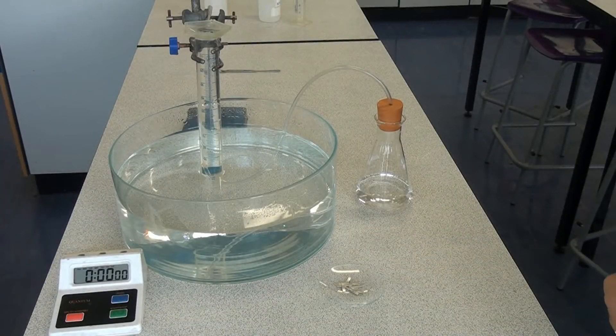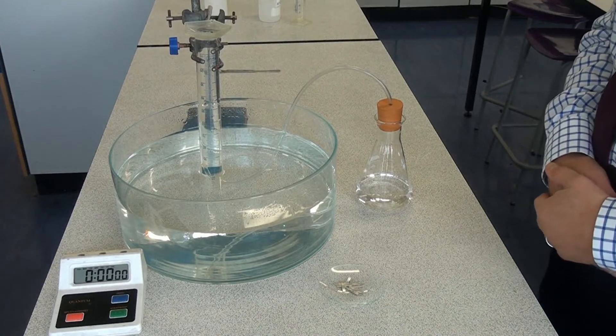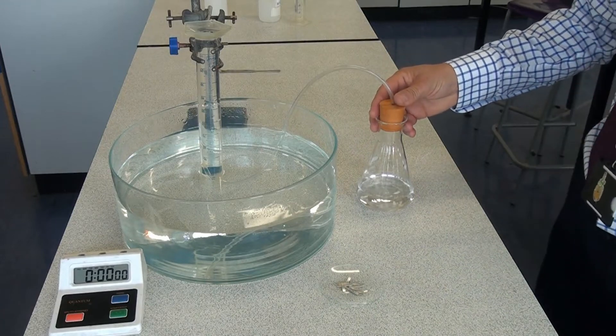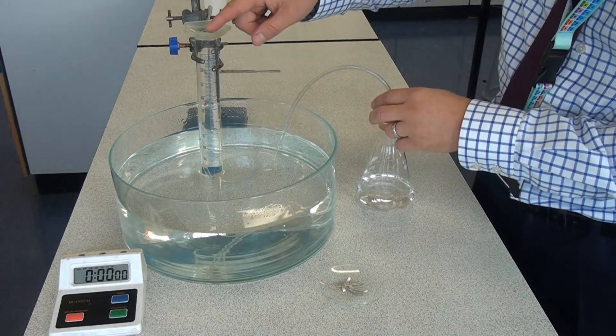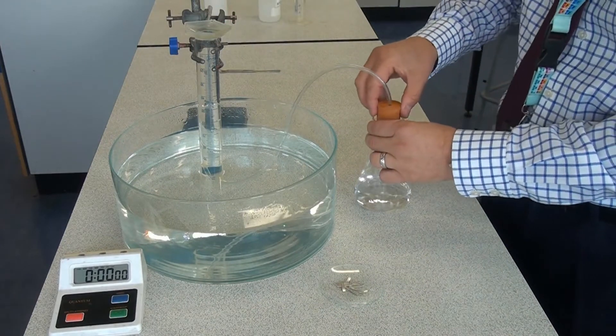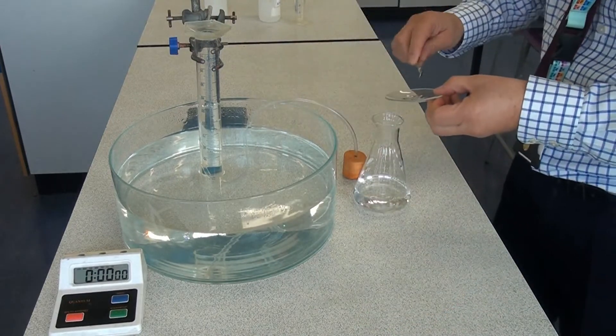So here is the second way of measuring the rate of reaction when we know the reaction is going to produce a gas. I've got a conical flask with the first reactant in and it's connected by a delivery tube to an upturned measuring cylinder that's got water in. So let's see what happens when I add the magnesium to the acid and the gas starts to be generated.